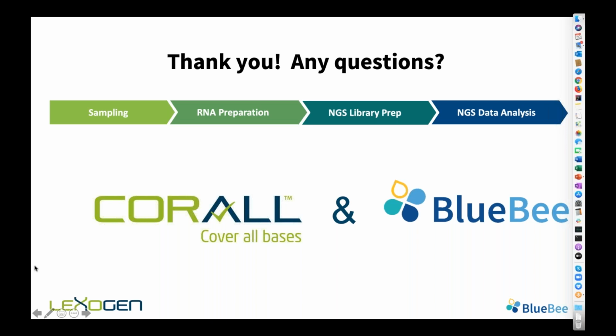Okay, the next question, how long does the CORALL data analysis on the BlueBee platform take? For a regular data set, that is below 1 hour, between 30 minutes and 60 minutes.